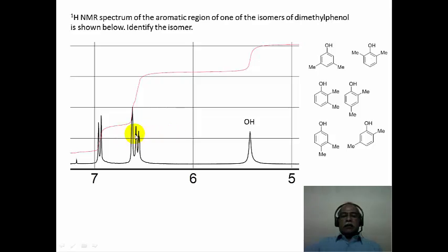If you look at the spectrum very carefully, compared to benzene which comes around 7.28 ppm or so, the chemical shift values of this phenol are coming at lower delta value. This is essentially because the hydroxy functional group is an electron rich, electron donating substituent. So the electron donating substituent makes the 2 ortho positions in this molecule electron rich.